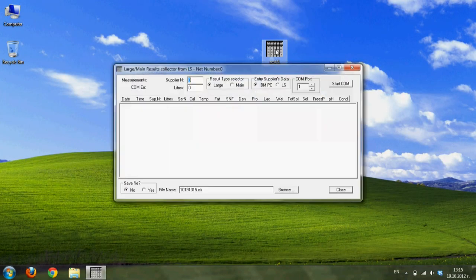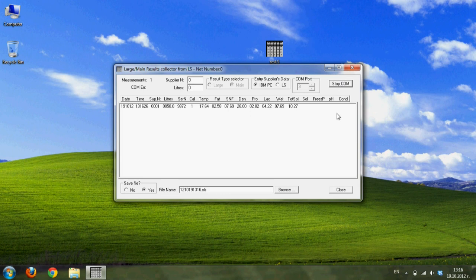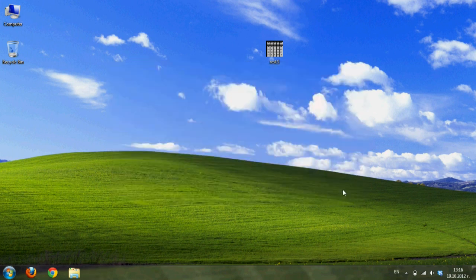Open file RSLS. Enter the number of the supplier and liters delivered. For example, 1 is the number of the supplier and 50 is quantity of the milk. Click on the blank tab. Click on S to save the results in an Excel document. The file will be named 10, 19, 13, 15, where 10, 19 is the date: 10 is the month, 19 is the day. 13, 15 is the time: 13 o'clock, 15 minutes. Set COM 3. Press Start. When you finish measuring, press Close. The software will automatically save the file.